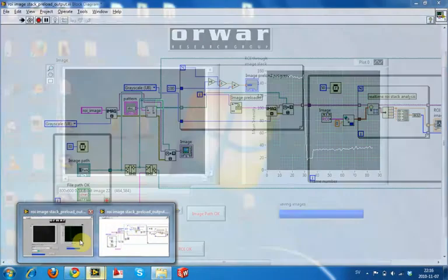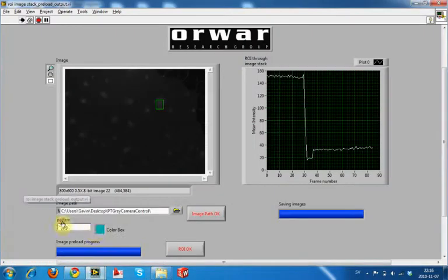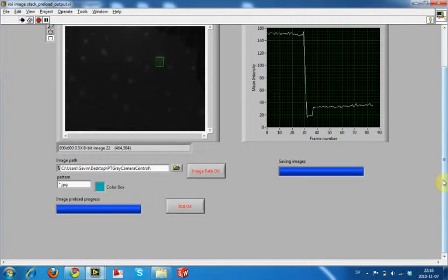So okay, we're going to switch it from red to, I suppose, this kind of cyany blue color. And this takes a little while to save the images because it's actually doing quite a lot. Not only are we opening the image and then up converting it to a higher bit depth, we're also changing the color type. The reason why that's important is because we're switching it to a HSL image instead of an RGB image.